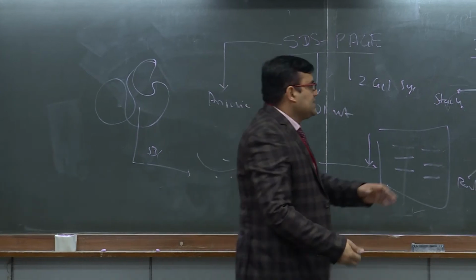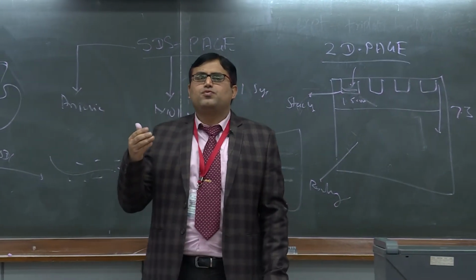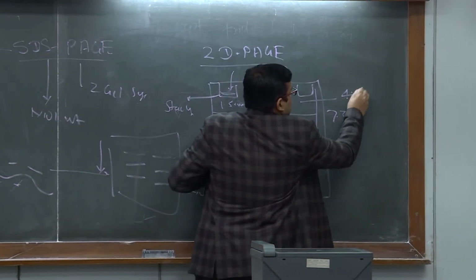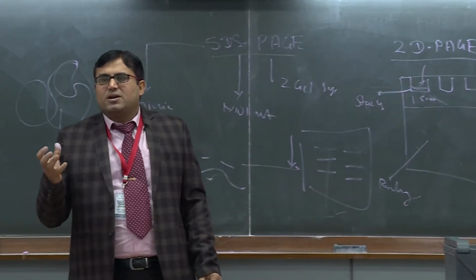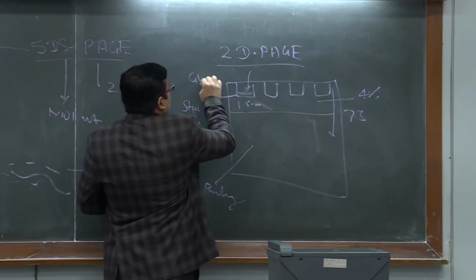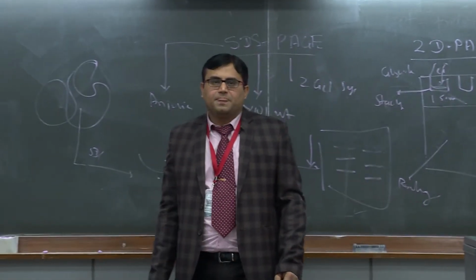Since this stacking gel is at very low concentration, most probably we are using 4% polyacrylamide gel for making the stacking gel. Your protein will enter inside the stacking gel, and in your buffer you are using ions called glycinate and chloride ion.